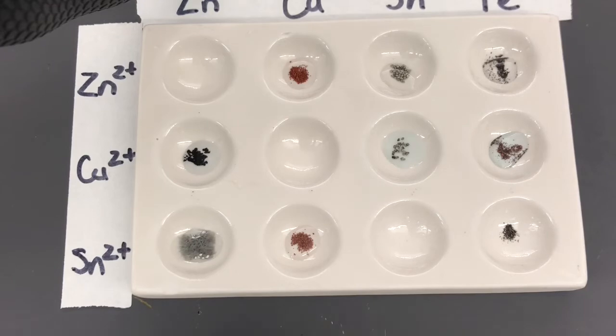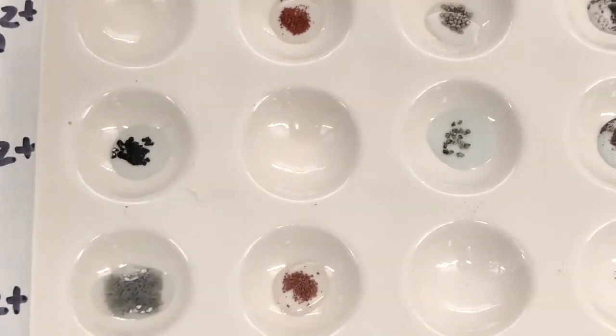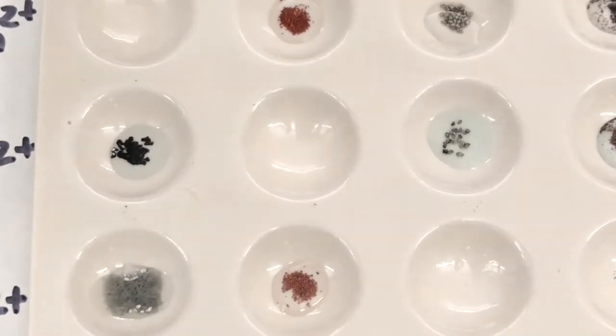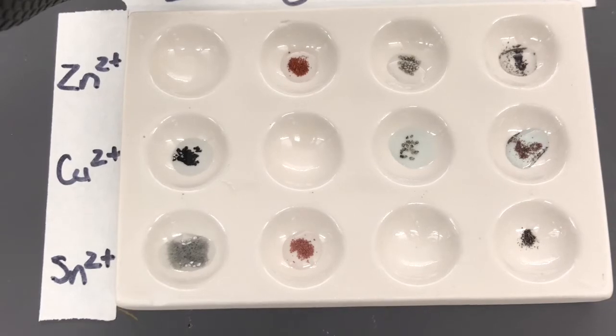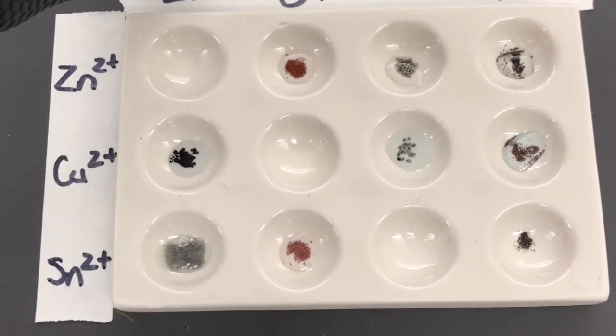So we've added our tin 2 plus to the copper. For the time being, it appears that all we really see is the copper metal in solution. So for the time being, we will say that's no reaction.